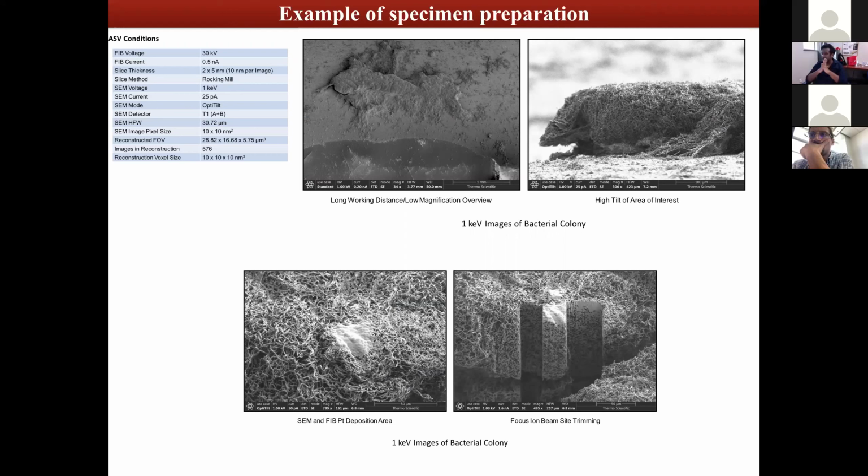And kindly note, we are not going to use a very strong accelerating voltage to image this, otherwise the purpose of doing cryo imaging or using a cryomat imaging will be defeated. Typically we use a 1 kV accelerating voltage to image that. But even that is quite good enough for us to get all the details that we need from these kinds of experiments.